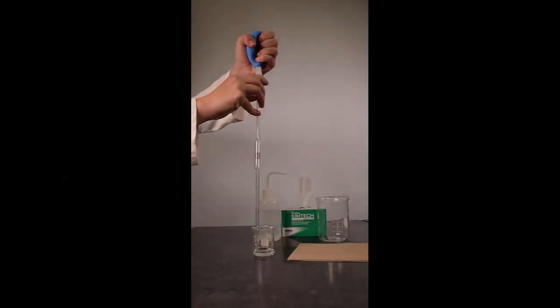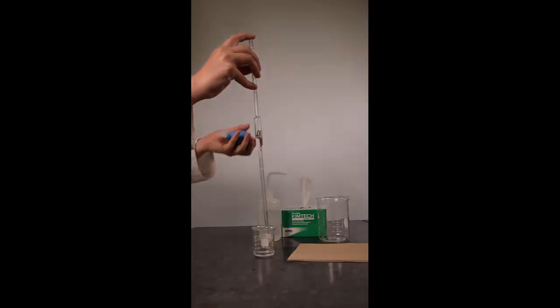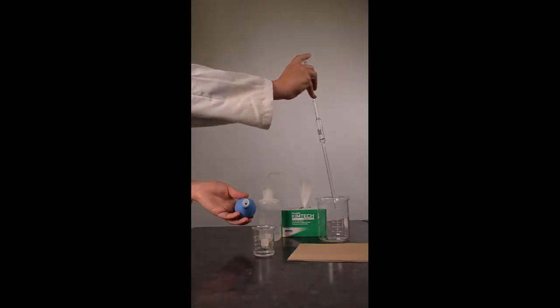When using the suction bulb to fill the pipette, make sure that the container from which the solution is being drawn contains more than enough solution to fill the pipette, and that the pipette tip is kept near the bottom of the container and well below the surface of the solution.